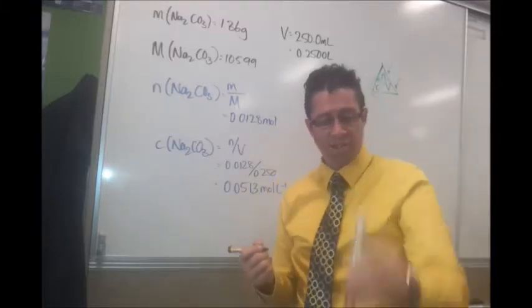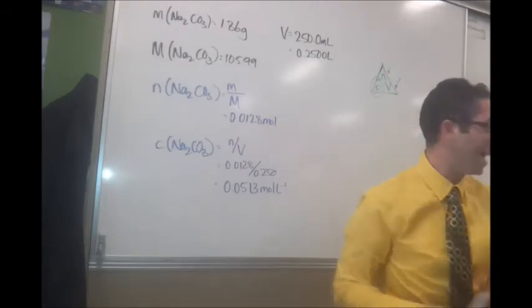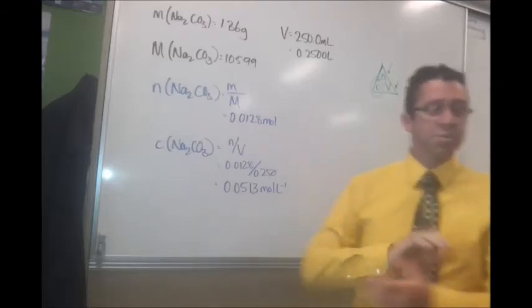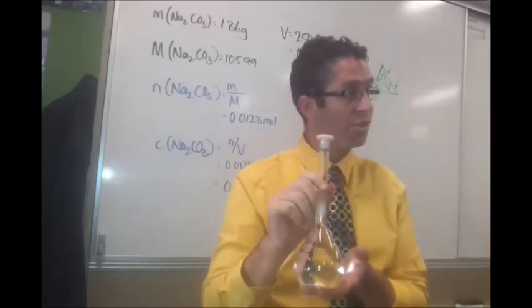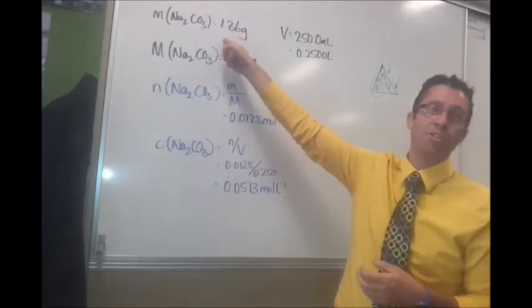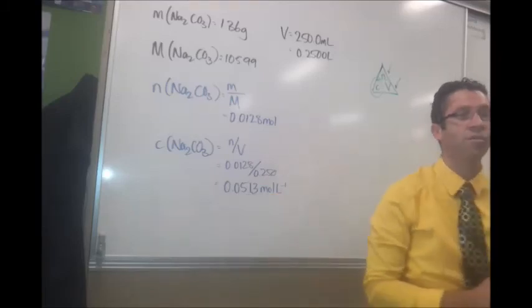Alright, that standard solution is now available to be used for titration, which is what we're going to be doing later in the week. Right. So your task now is to put all of this together. We've done the first step, so that's okay. On our other board, that was predicting the mass we need, which is 1.32 grams. Then you've got to make a standard solution, which the second bit showed. Then once you know exactly how much you did use, which probably won't be 1.32, calculate to 3 significant figures, so 1, 2, 3, what is the actual concentration of your solution.